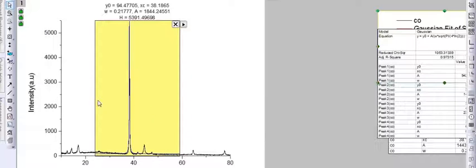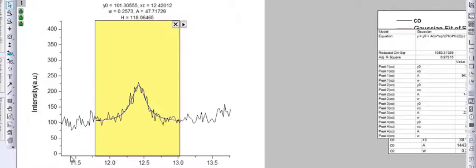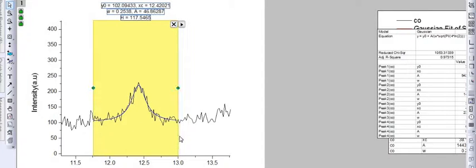So here you got this window. If I want to calculate the parameters for every peak which is present in the graph, what I'll do, I just use the magnifier and select the peak. Let's say this is my peak. As you can see, you can stretch the window so that it looks good and fits.